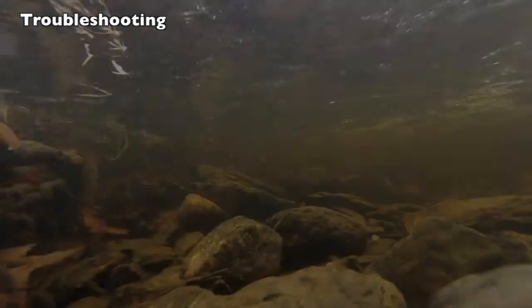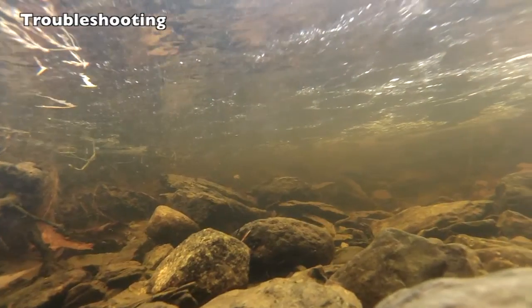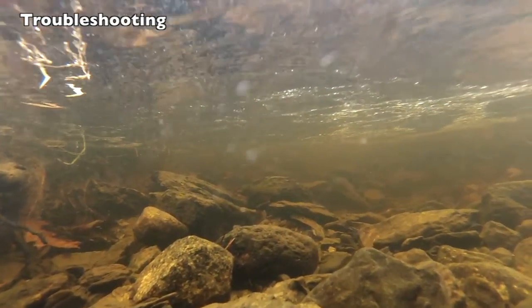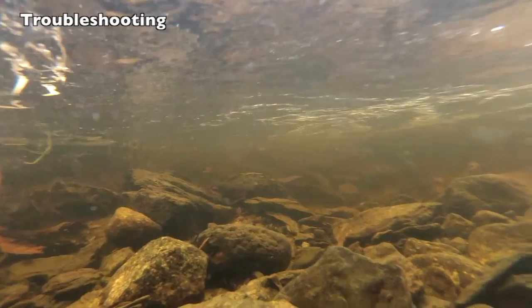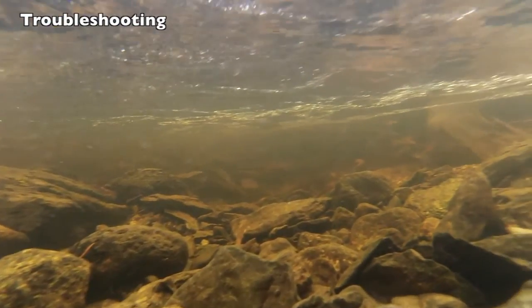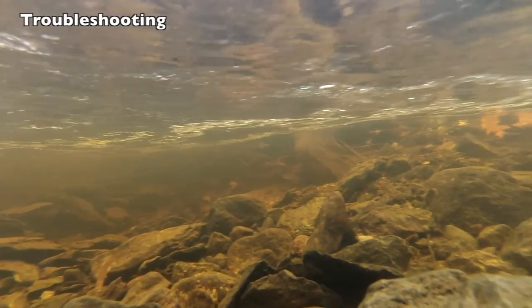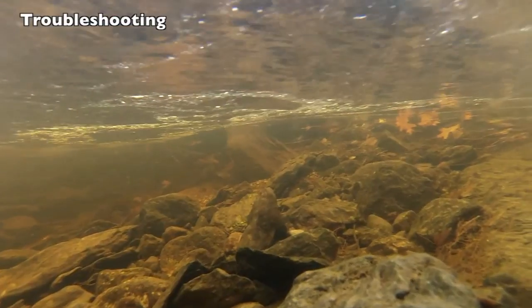Troubleshooting: Your water body has nothing but rocks. Lift up a few cobbles or rocks gently and see if there's mud or sand underneath and sample that. Make a note or take a picture of how rocky it is. If you are unable to find an area with sediment to sample, make a note on the data sheet that sediment samples were not taken.